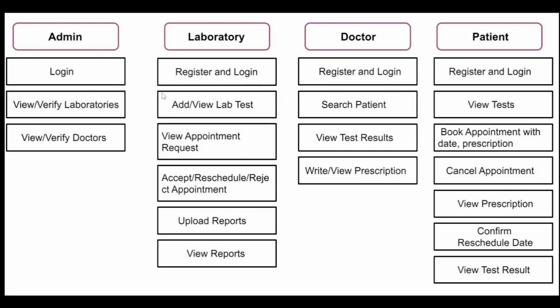After logging into their accounts, laboratories will add the tests they will do in their laboratory. So these are the tests. When they add a test, they will add what the test is and its description. Laboratories can view the lab tests they are currently running in their lab. So let's see the patient module so that we can clearly understand the flow.